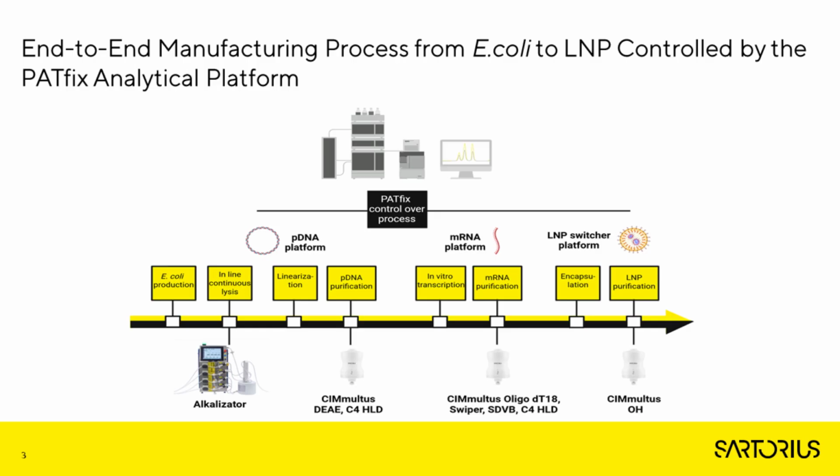Okay, let's go now to the main topic of today's webinar, and this is analysis of lipid nanoparticles. I will start this webinar with a schematic presentation of the workflow in which lipid nanoparticles are produced.